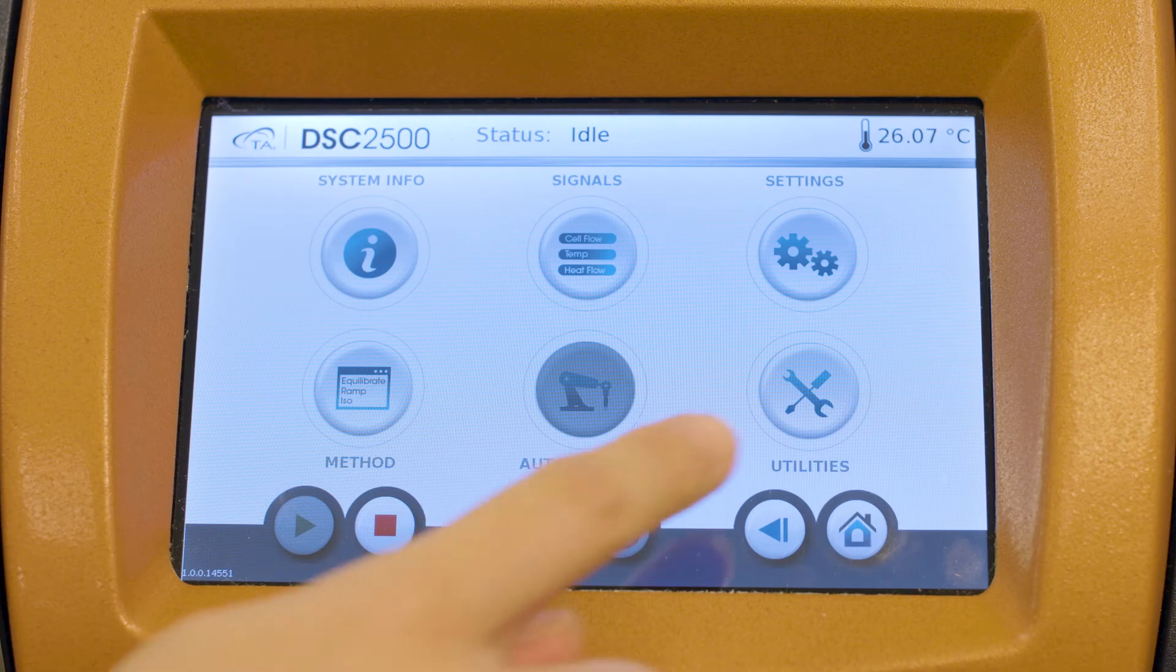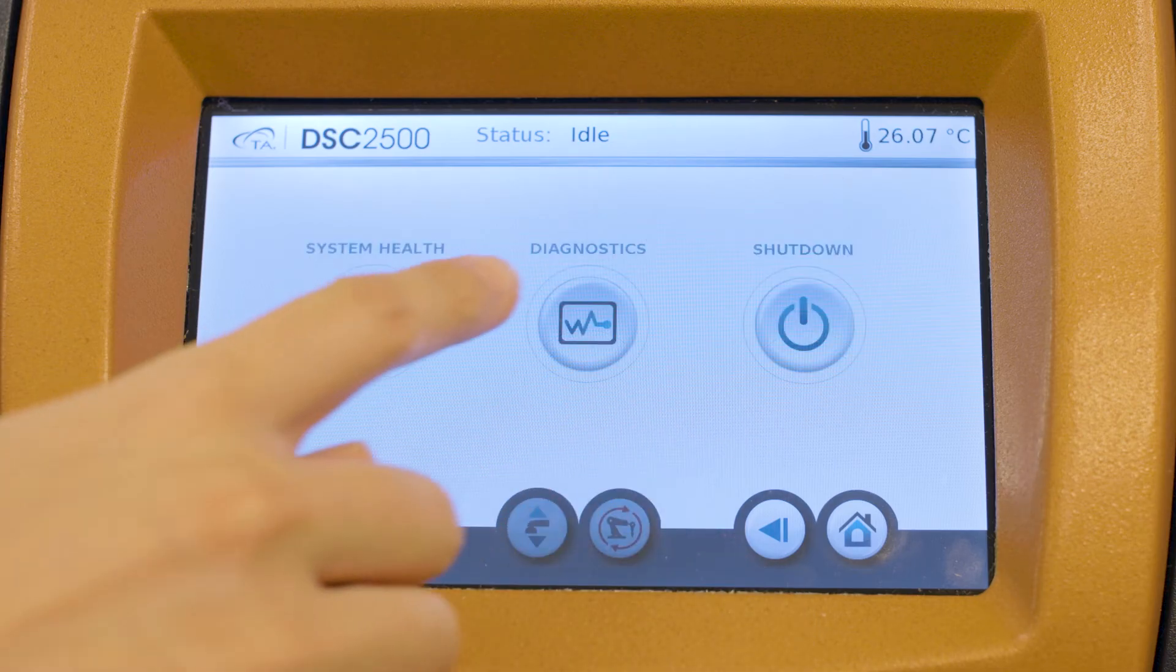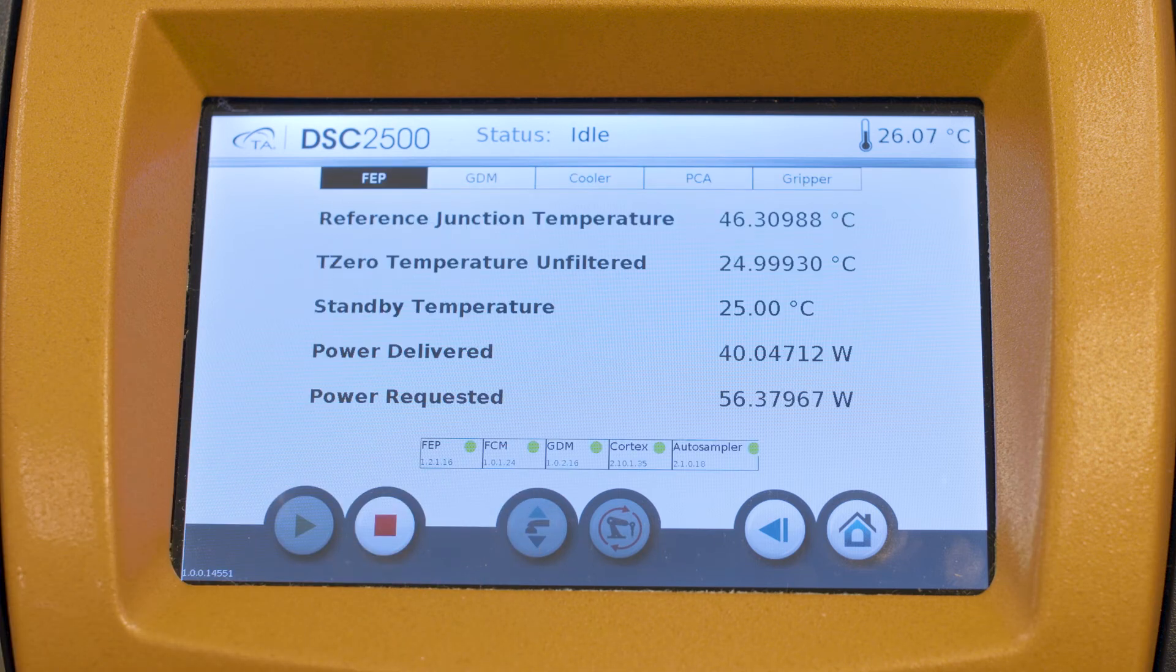On the touch screen, go to utility, diagnostic, PCA.